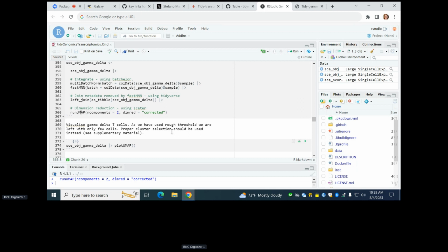But I think you can. There's a merge method for S4 data frames, right? Here we are not merging cells. We are just merging data frames, just the metadata. Yeah, S4 data frames, you can, okay. Well, we can discuss later. I'm not sure if we are talking about the same thing, but if we are, maybe that's another way that I'm not aware of.